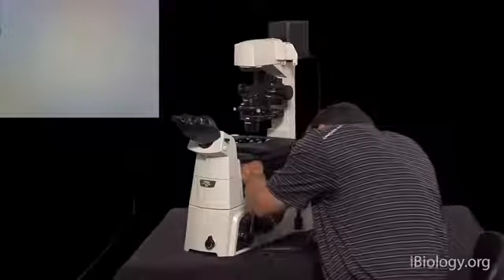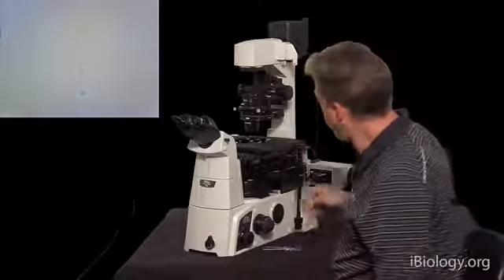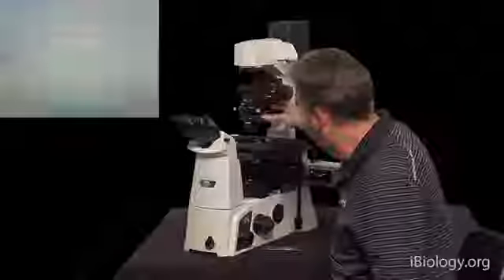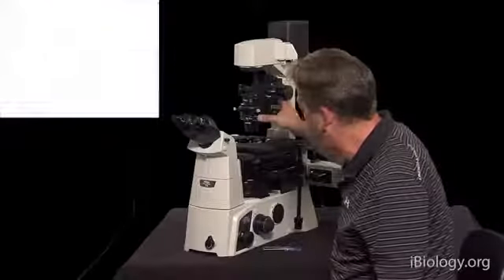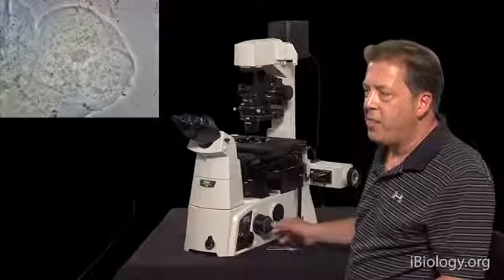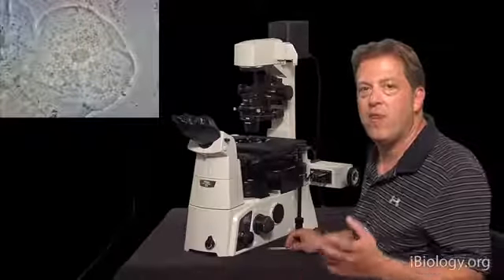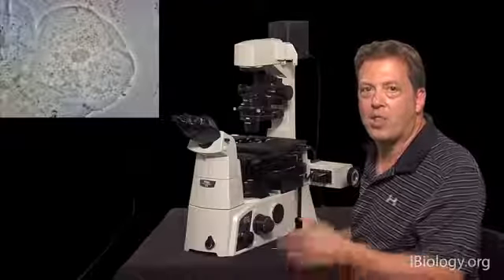So let me just put a phase contrast lens in place and remove our upper prism and place in now a phase ring. And now you can see a very different image on the camera. There's the same cell with the nucleus, but now what you're seeing is that the phase image is very contrasty. It doesn't look very three-dimensional, but it gives you very nice contrast, light and dark.